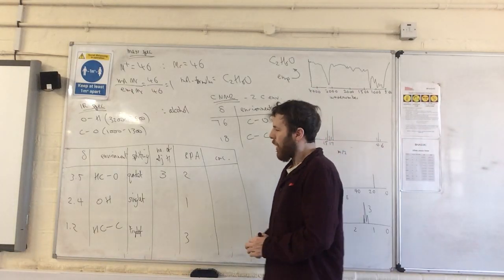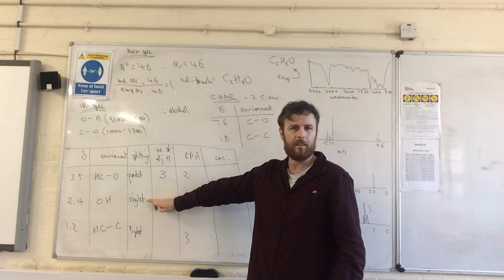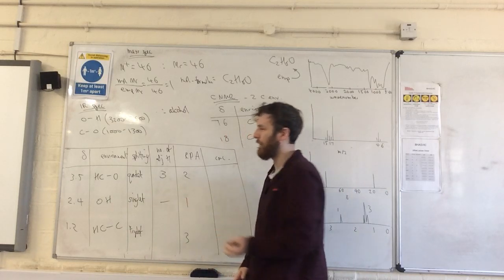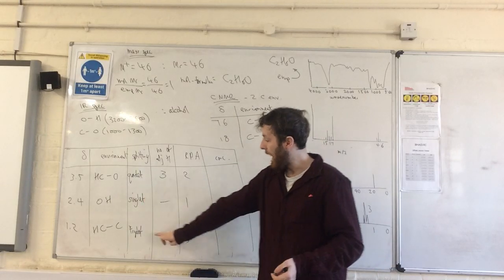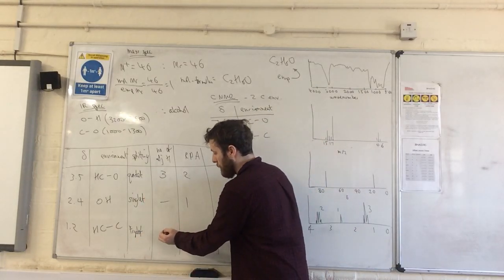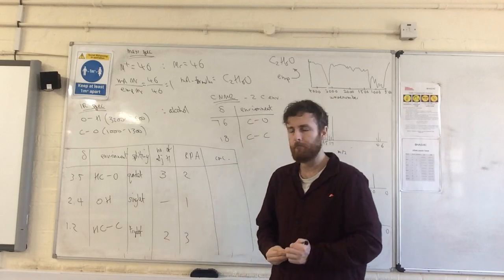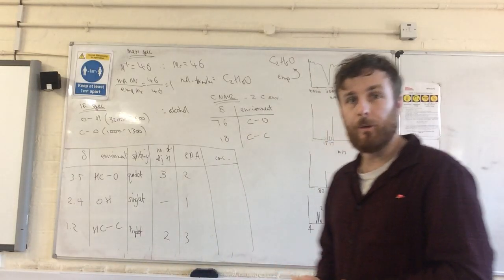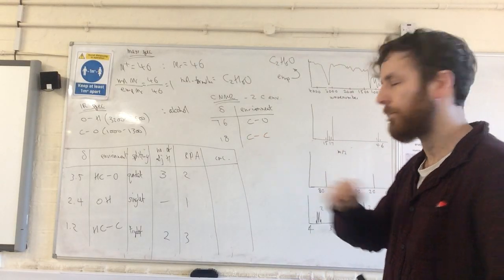Welcome back. Well, the splitting for OHs is always a singlet, so you can't really tell anything about that because they're always a singlet no matter what. And a triplet would have 2 adjacent hydrogens because 2 add 1 is 3. Okay, now come the 2 fancy tricks.